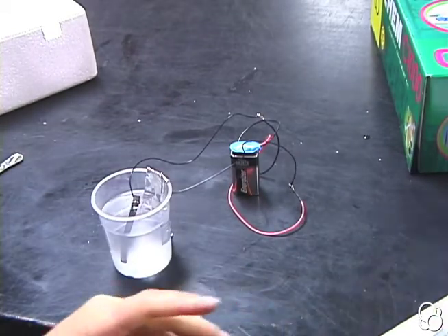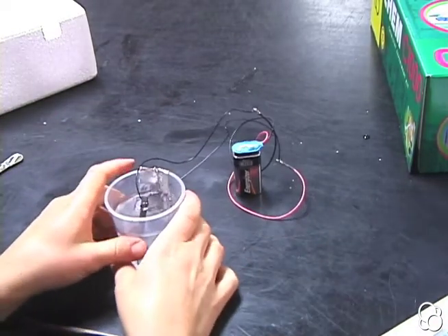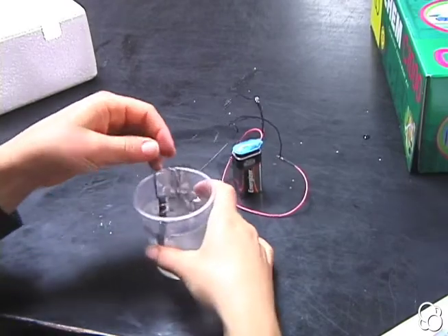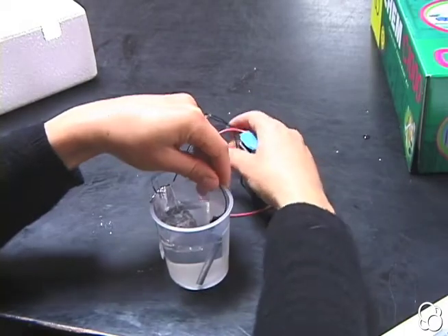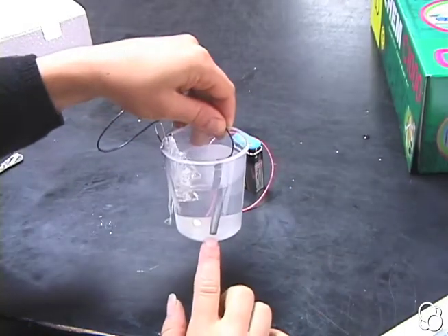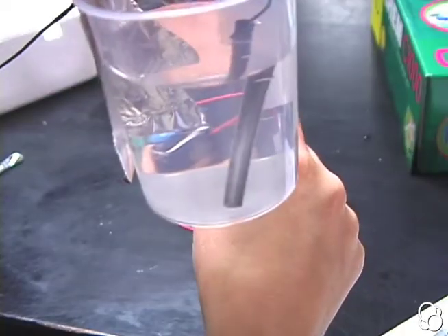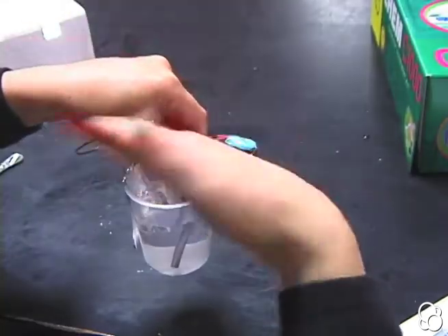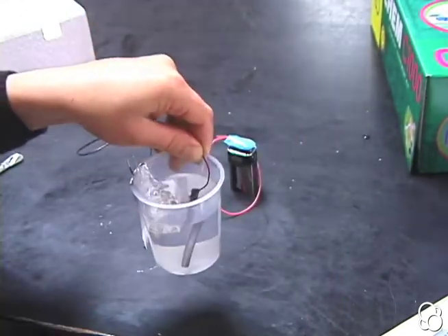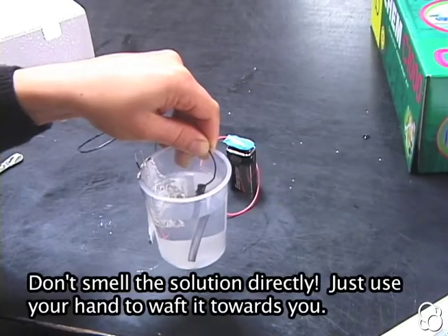As soon as the electrical circuit is closed, you should see gas bubbles arising from both places, from the graphite rod and also from the aluminum foil. That familiar smell from swimming pools.